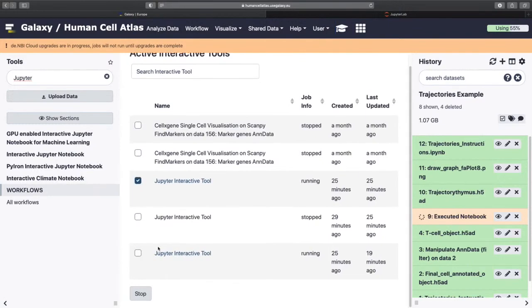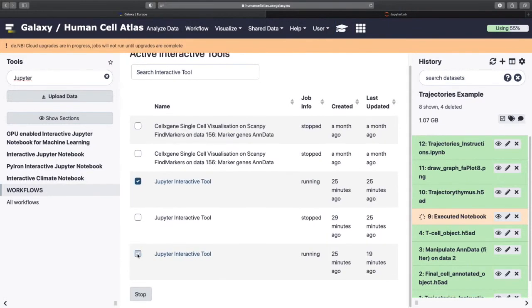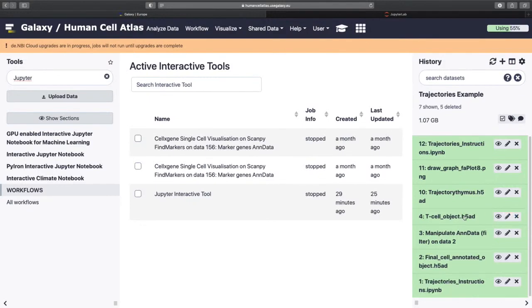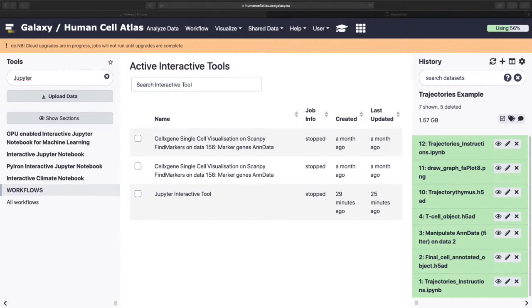Oh, I had another one. And then you're going to stop that tool. And it'll still look like orange in here. So I usually just delete it so I don't get confused. All right. That's the end of this tutorial.